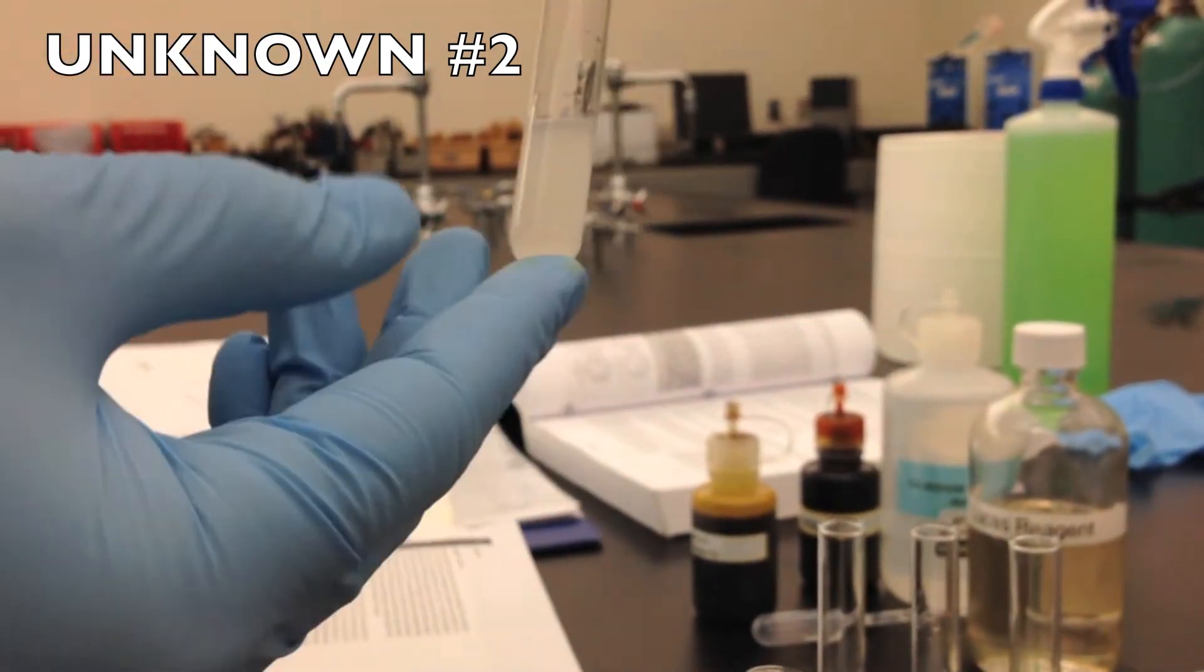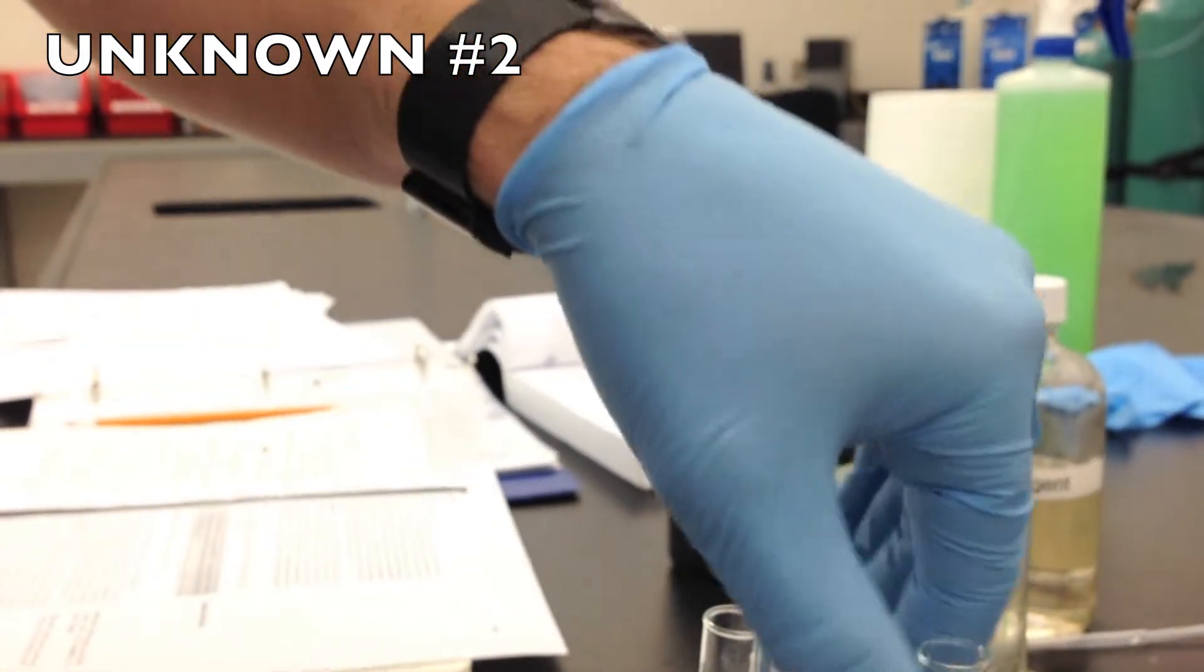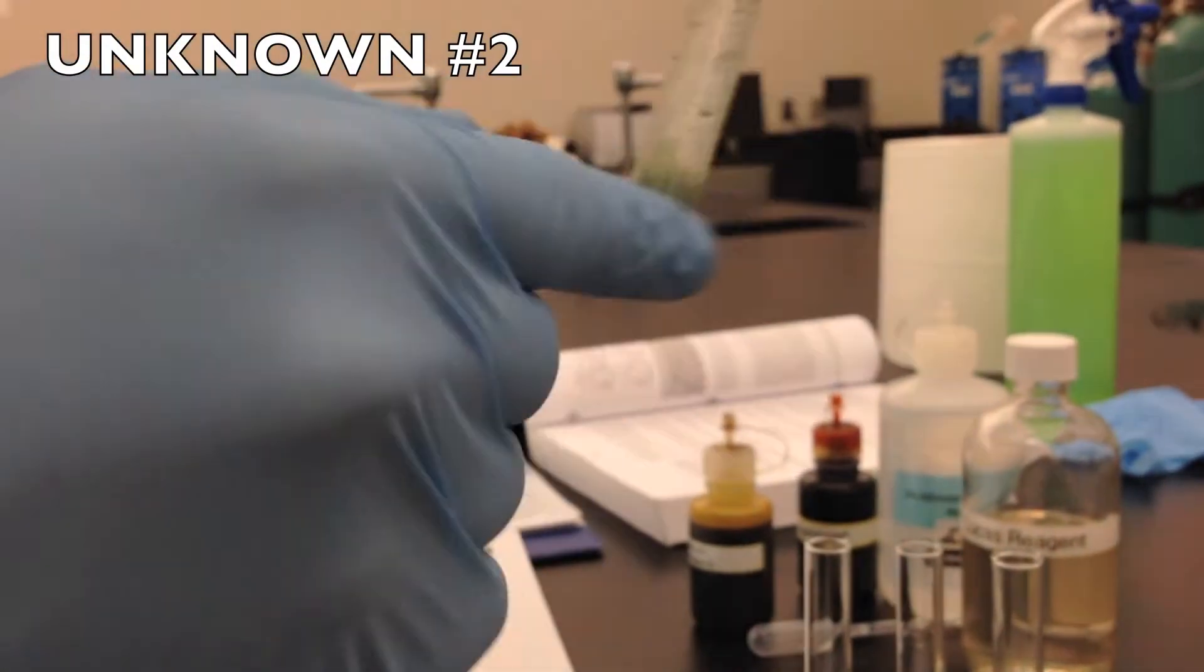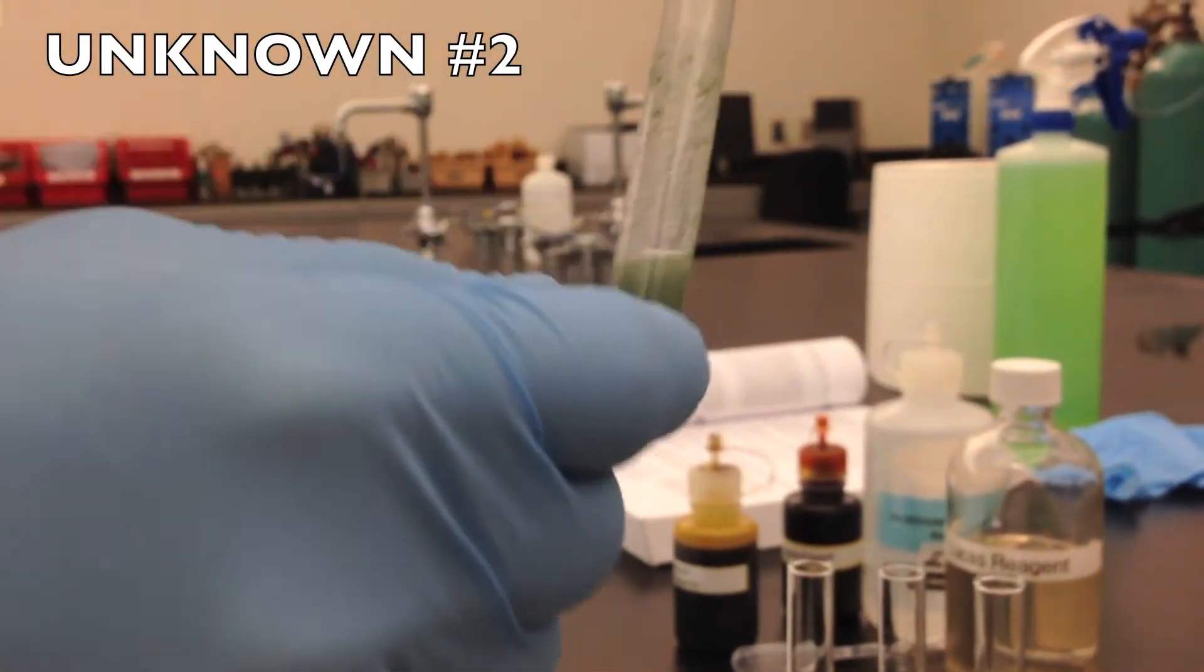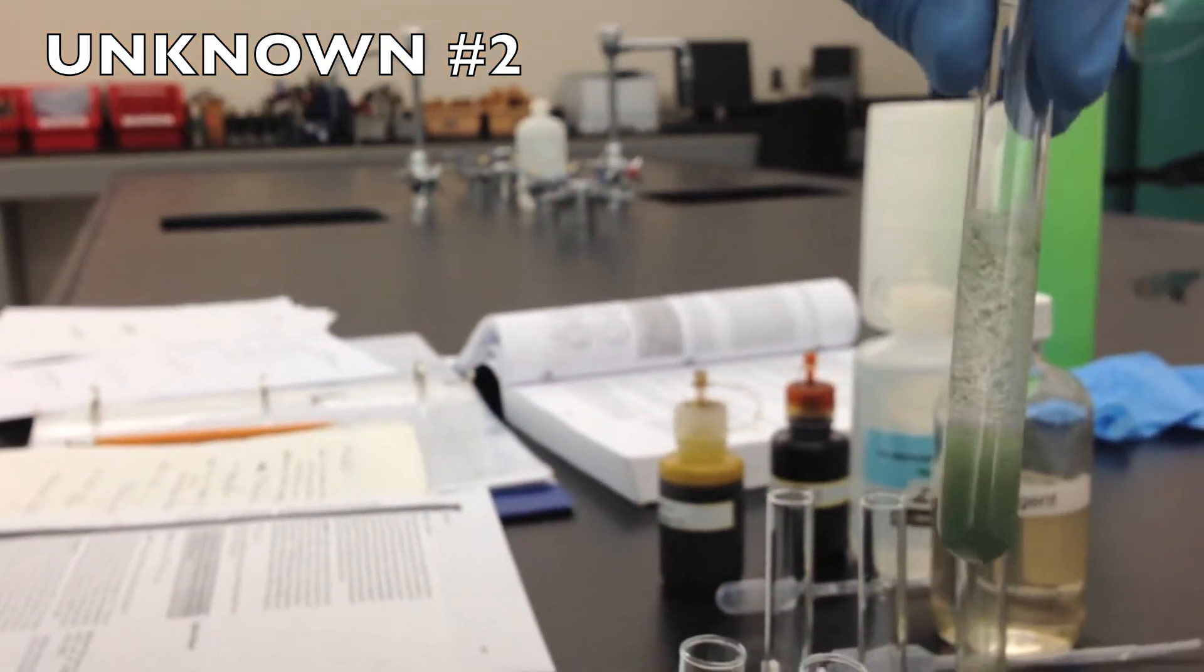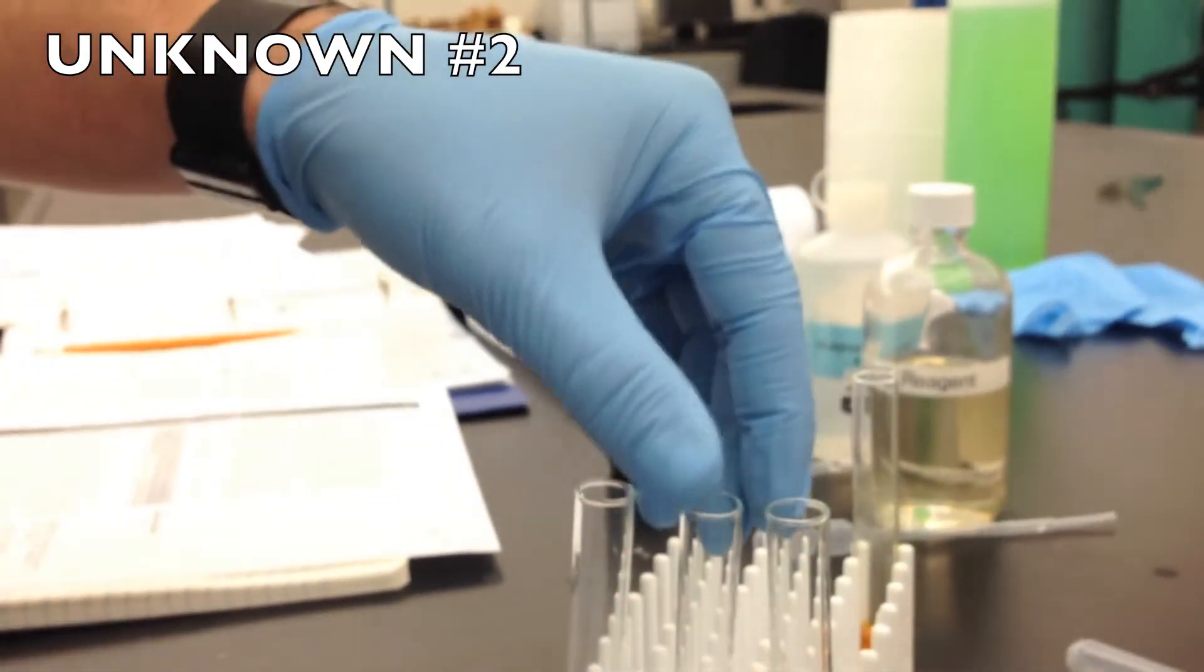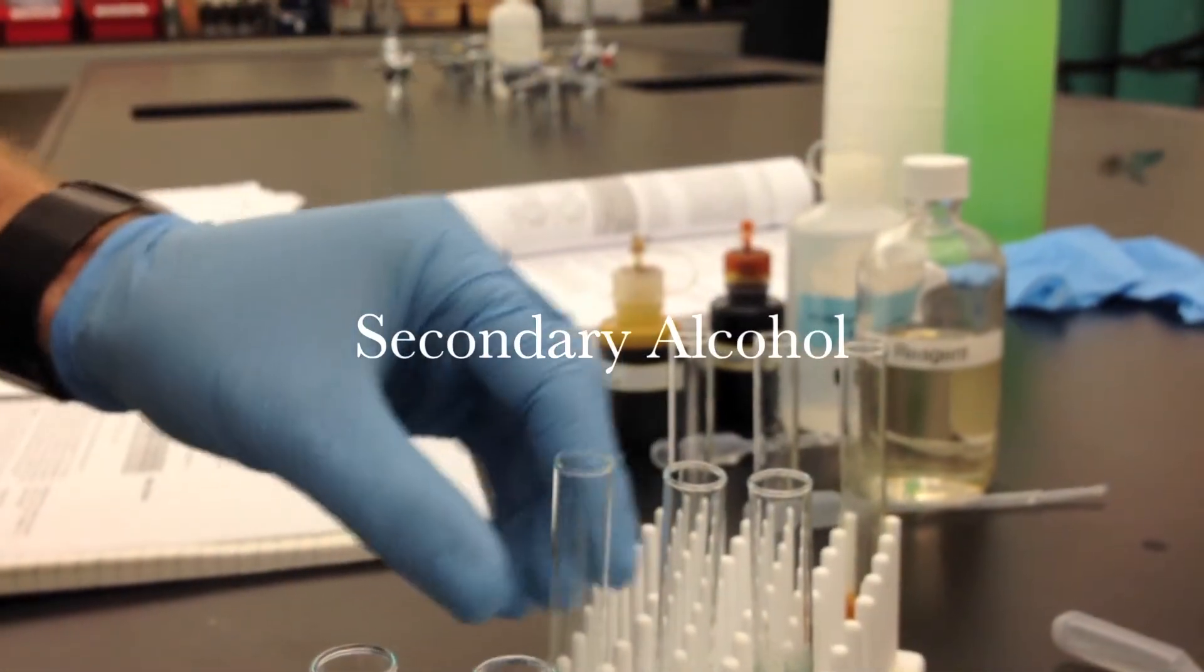And then we also got a positive result on the chromic acid test, which only indicates primary or secondary alcohol. So we can assume safely that the second unknown is indeed a secondary alcohol.